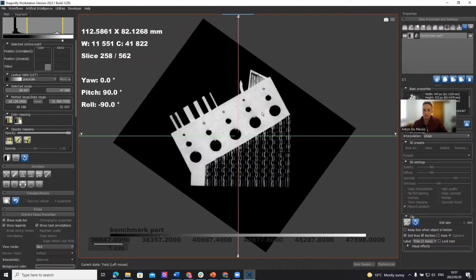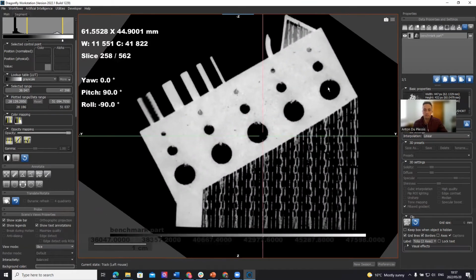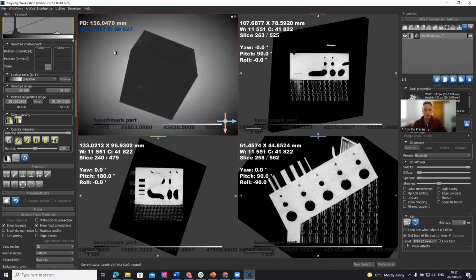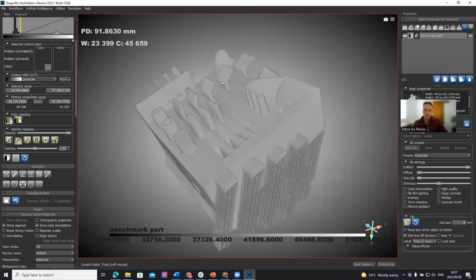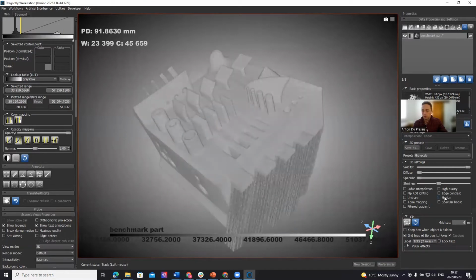What I want to demonstrate here is not any of this. I want to demonstrate a wall thickness analysis. This is a benchmark part with different thicknesses of features. Let me show you the part briefly with a shortcut thresholding tool here. This is a volume render of this part, and you see there are some specific overhang parts and walls, hollow cylinders and solid rods.